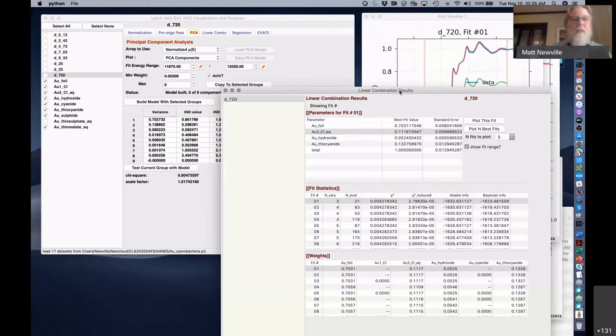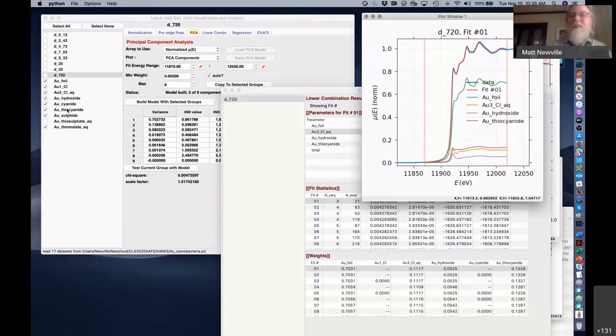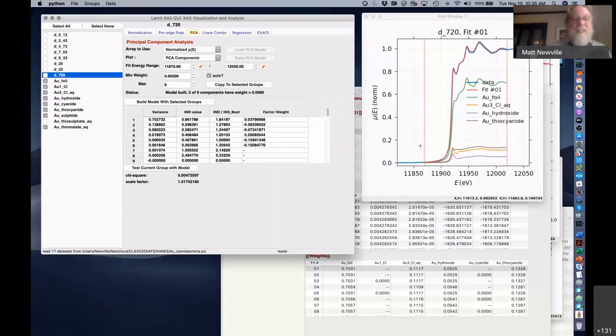So they don't have to be necessarily interpretable differences in the spectra. I mean, if you can't interpret the differences, at least qualitatively in the spectra, point to one and say, yeah, that looks like iron metal and this one looks like iron sulfide, then you're going to have a hard time understanding the data anyway. But PCA works with any spectroscopy, any set of data. So it works on facial recognition or election data. It doesn't need to work on any aspect of chemistry, so it doesn't need any knowledge about the spectrum.